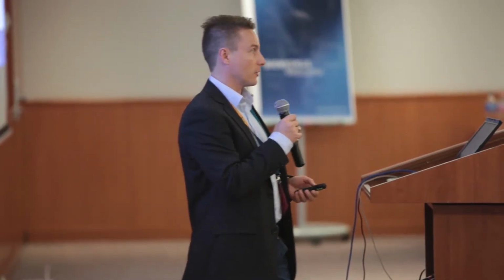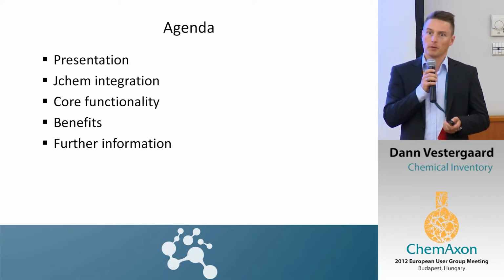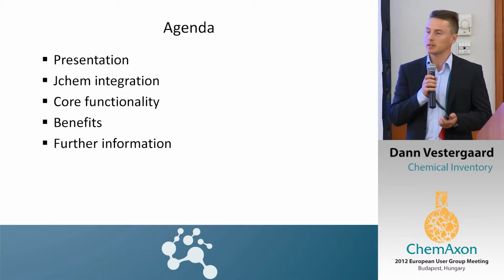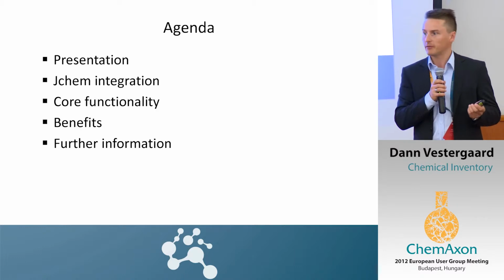And a short agenda for the day. We only have 10 minutes to do the introduction, so we'll do a short presentation of the product. After that, I'll go a bit through the application, focusing on the JChem and ChemAxon integration, and we'll have a bit about the core functionality and benefits after that.